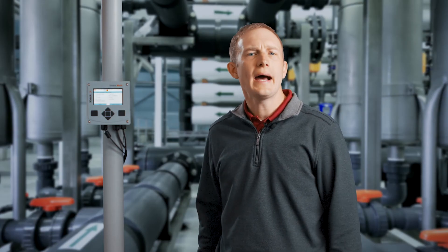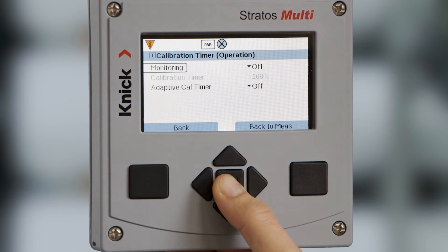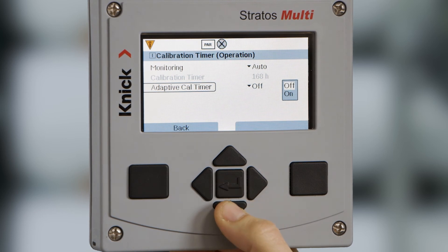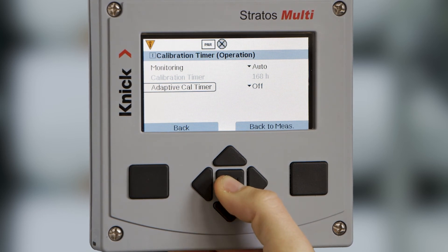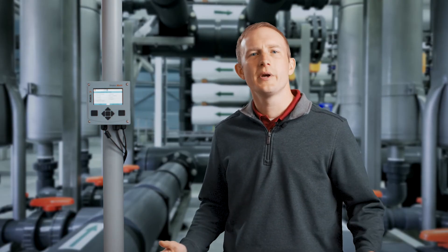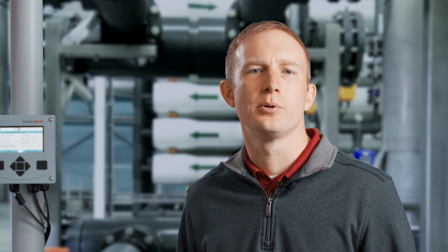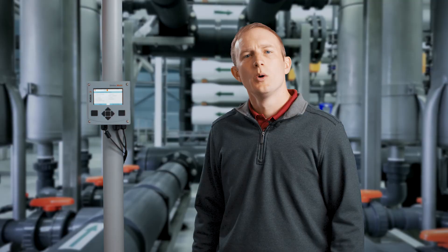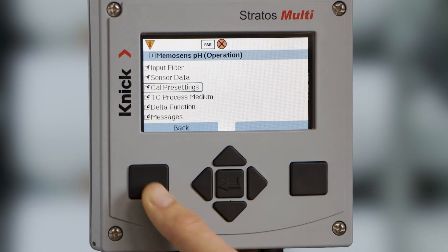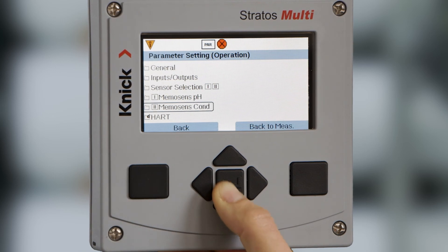Lastly, under Cal presettings, the calibration timer allows us to set either a fixed interval or an adaptive evaluation based off sensor loads for indication that a calibration is needed. Please remember that these are default calibration settings which we are configuring. These settings can always be changed by the operator at the beginning of any calibration procedure in the Cal menu. We will repeat the process for the conductivity sensor on channel 2, this time selecting manual for the Cal mode.